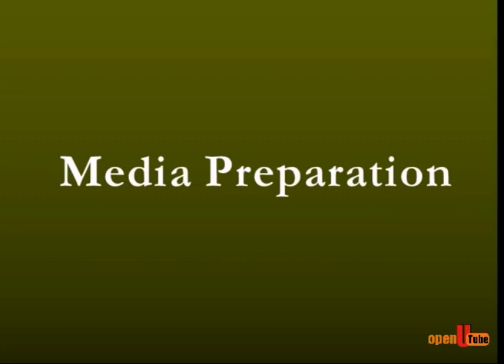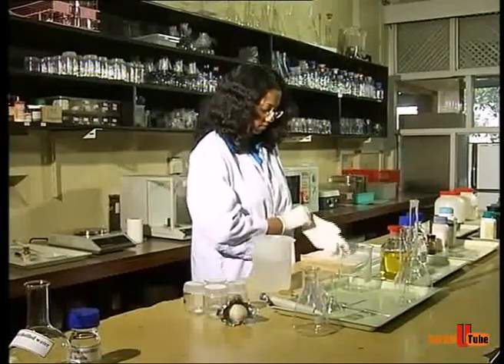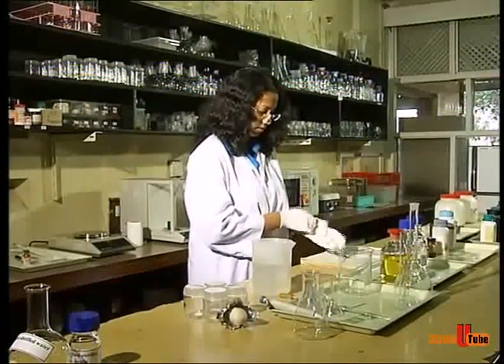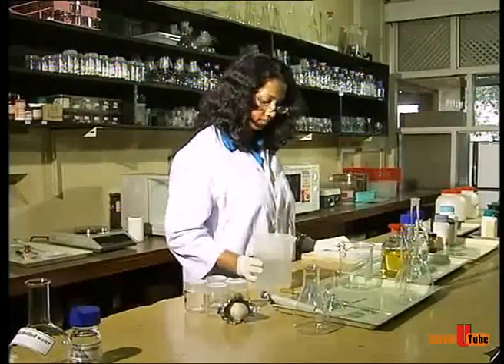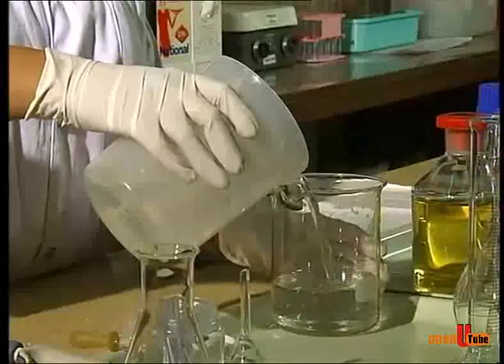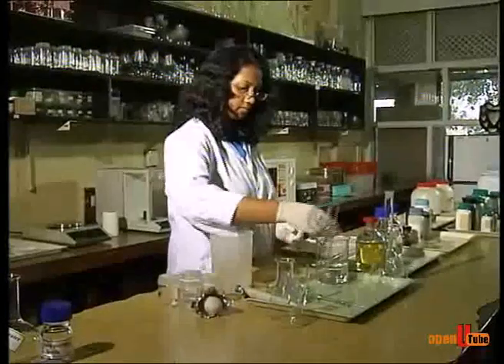Media preparation. When you prepare tissue culture media, it is very important to maintain sterile conditions. In order to prepare MS medium, first take 300 milliliters of distilled water into a beaker.